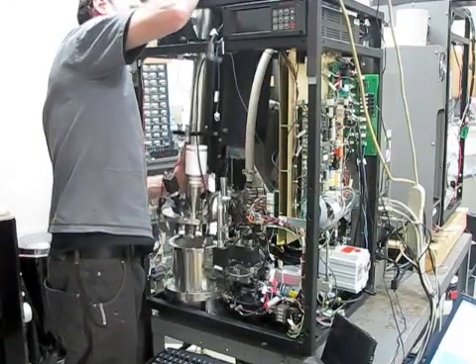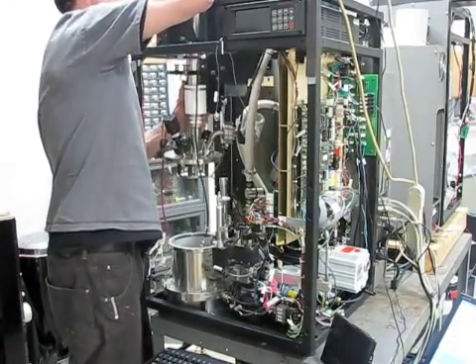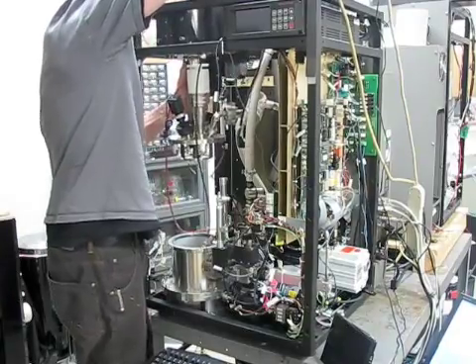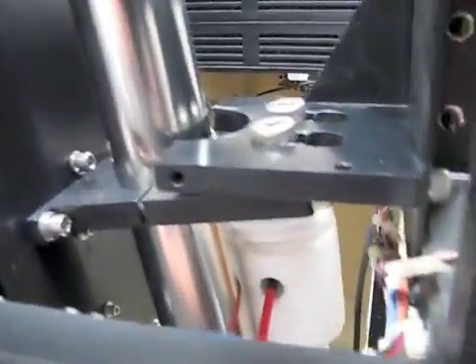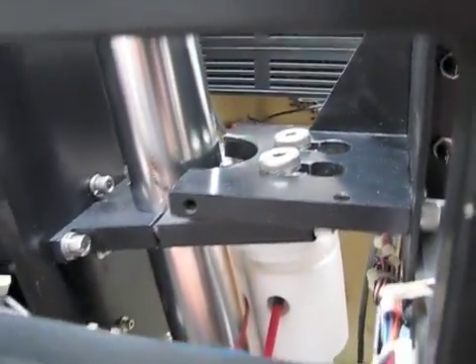Now just lift up on the flight tube. Be very careful that everything is out of the way and that you don't damage anything. It's best to have a second person to help you with this process. You can see how the flight tube is secured here.